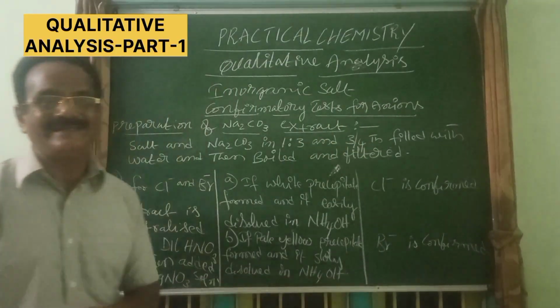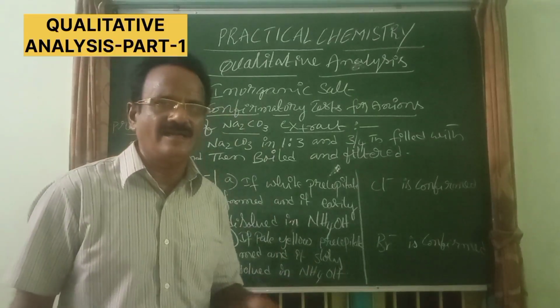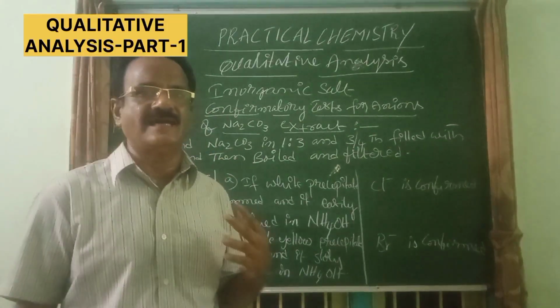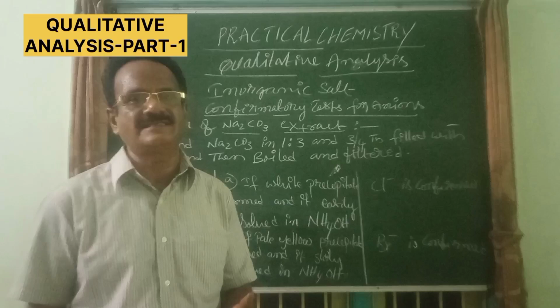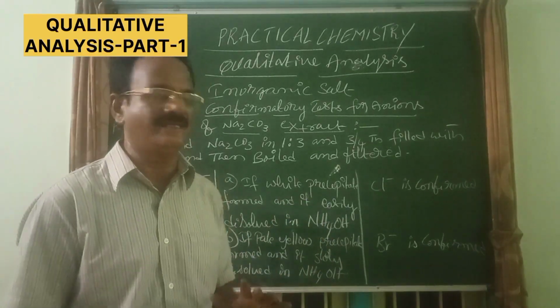Okay, not two observations need to be considered. For the ion which is present or identified in the identification test or dry test, only the confirmation test is to be done. Is it clear?